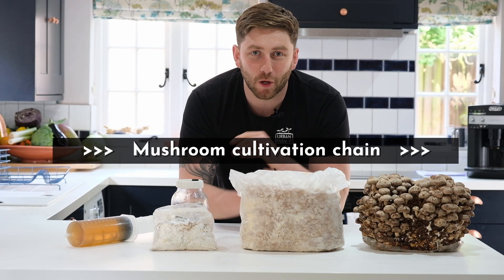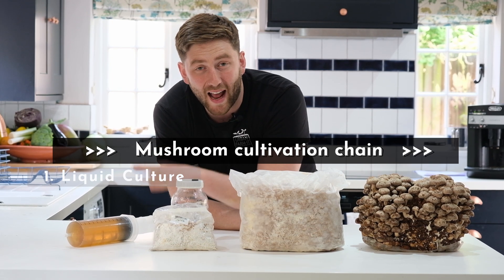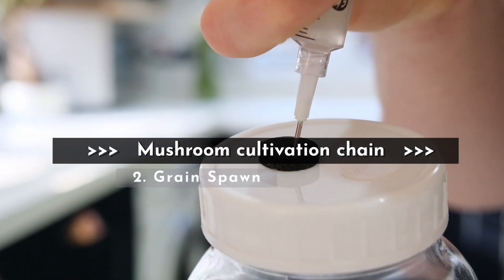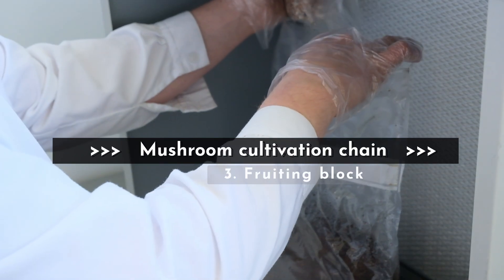And this is the mushroom cultivation chain. First things first, we have liquid culture where we've taken a mycelium sample and added it to our nutrient broth. Once that's ready, we then inject it into sterile grain to make grain spawn. Once our grain spawn is fully colonised, we'll take that and add it to a sterile substrate.